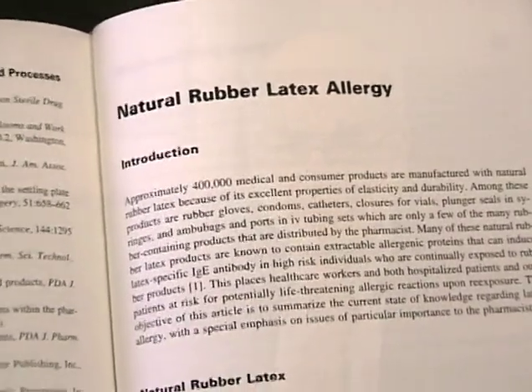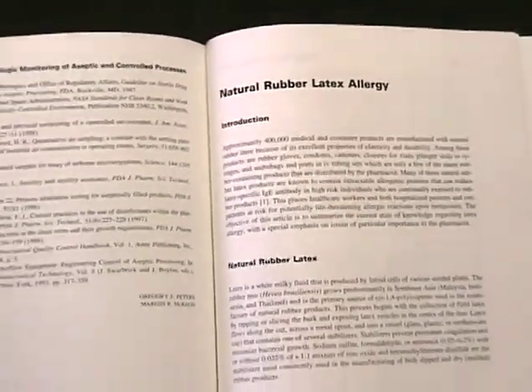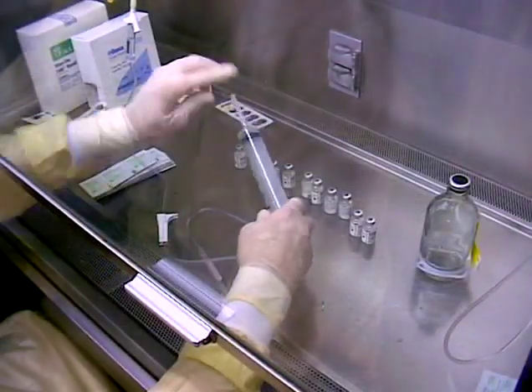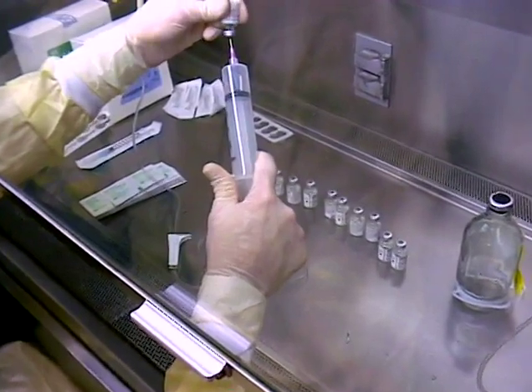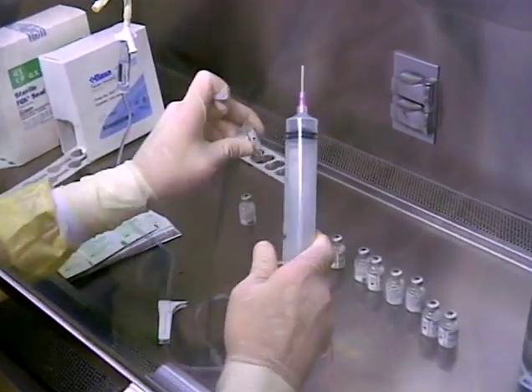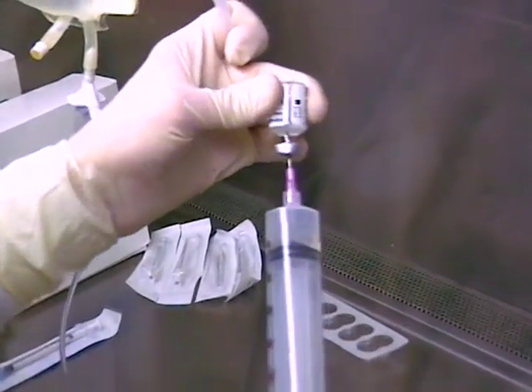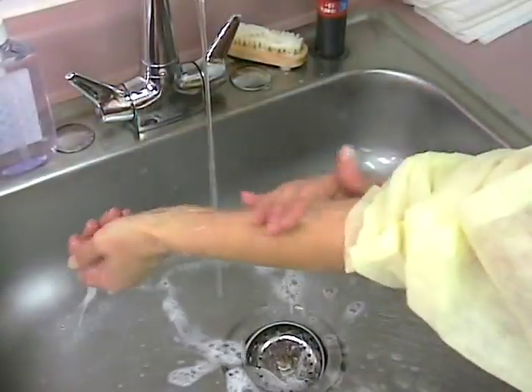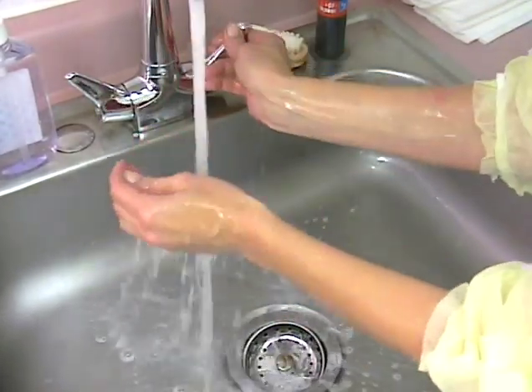Latex allergies are serious and widespread, but there are a number of latex-free gloves in the marketplace today. Yes, you may need to modify your procedures and slow down some, at least at first. But skin constantly gives off or attracts clouds of particles, dust, and skin fragments, which you can actually see when viewed with special backlighting. Washing hands is important, but can result in more particles and bacteria being brought to the skin surface.